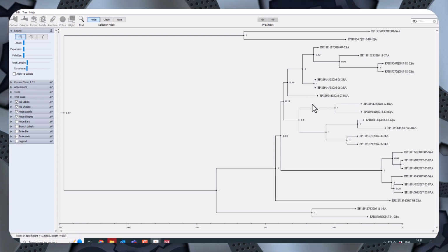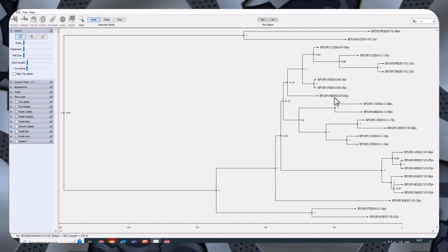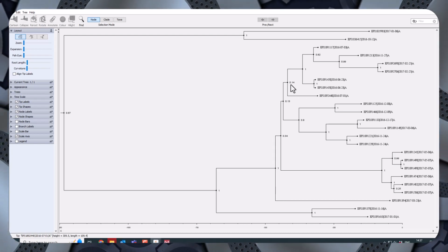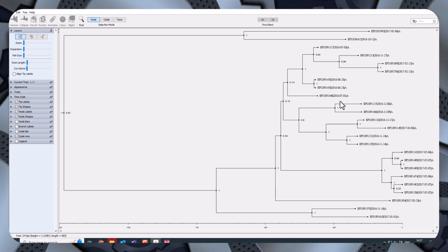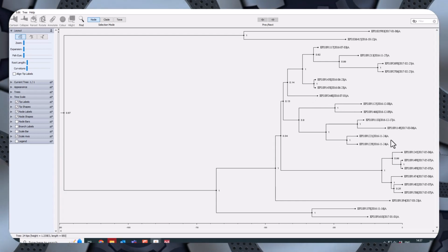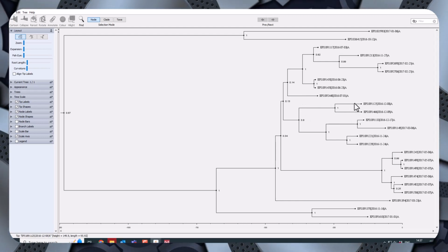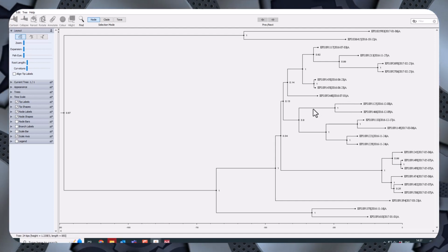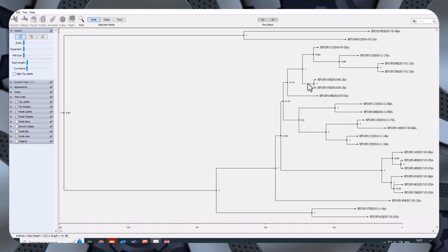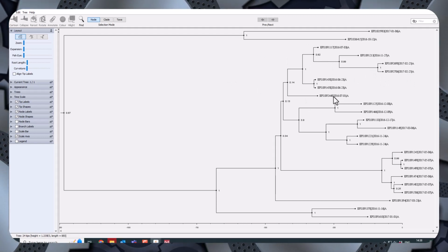But most often, it's seen here. But that's still only 14% of all the different ways that you create it. The only thing you need to keep in mind is this is a problem. This sequence is a bit weird. Otherwise, you don't need to think about it at all. And here, this 34%, this is to do with this one being a problem as well. So usually you find it when you've got single ones out on their own, they're not easy to place in the tree. So that's all good.